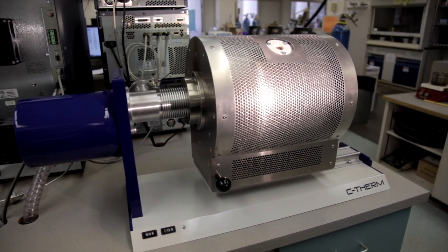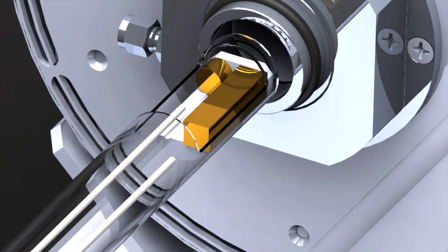C-Therm dilettometers have three main components: the sample holder and pushrods to support the thermal couple and the sample. A variety of sample holders are available in fused silica and alumina.